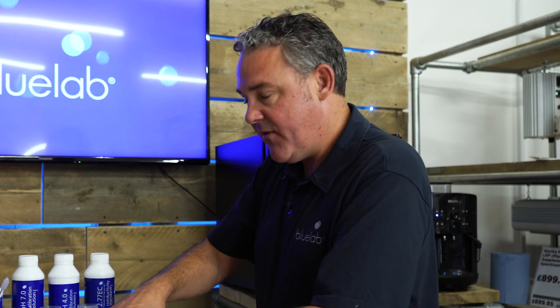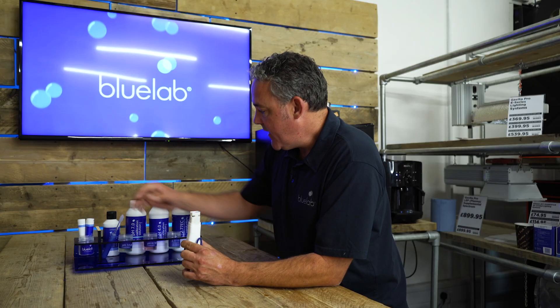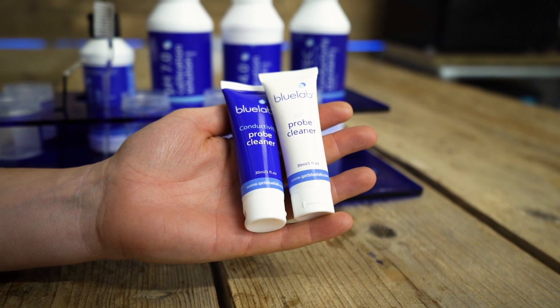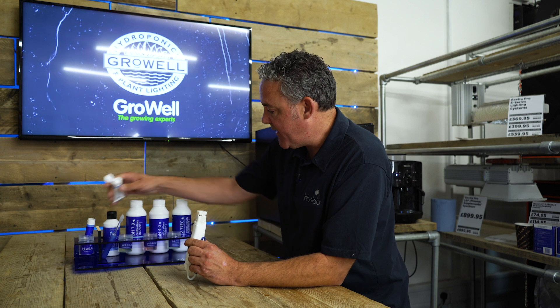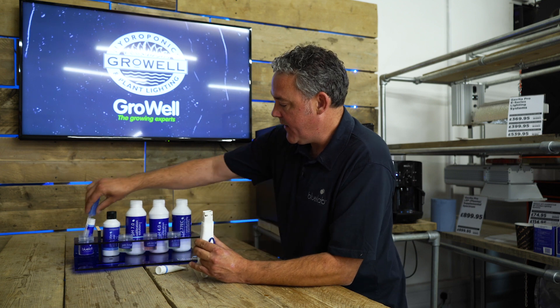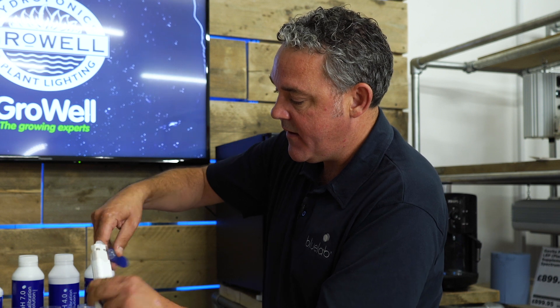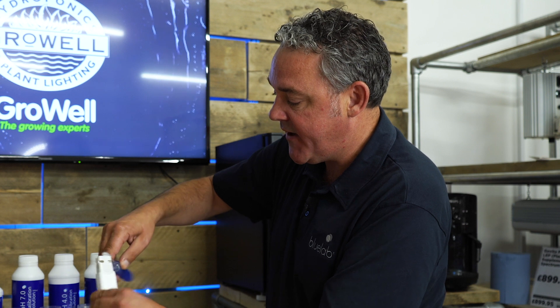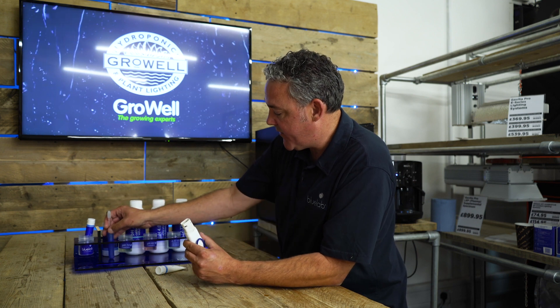The other thing you need to do is clean it regularly. We recommend that you clean it before every calibration and calibrate it once a month. We have a cleaning solution — it's a pH probe cleaner, just a mild detergent with no perfume in it. Perfumes tend to be oil based, and oil is a problem on these probes. Put a few drops of this onto the brush, then put it into water and gently brush the probe. Don't clean it with a side-to-side motion because you'll break the glass bulb — just make sure the outside of the glass is clean, then rinse under running water.